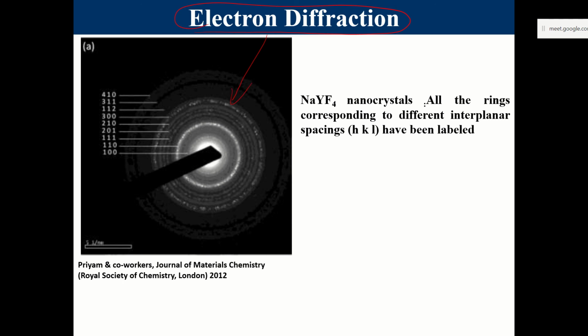You can see this electron diffraction pattern, a ring-like structure. These are the bright fringes that you see corresponding to different lattices, and this was done by me. This electron diffraction pattern is none other than, it's yours truly. Yeah, it's me. It was done by me when I was at the National University of Singapore. So this kind of thing is commonly used.